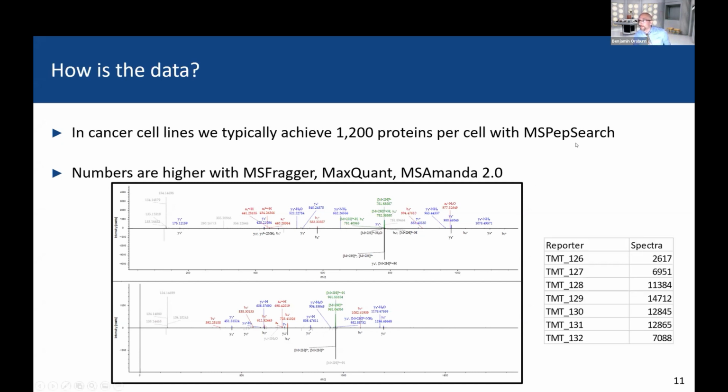And this is actually really new here. Connor Jenkins, when he was working for me in the past, wrote some really smart Python scripts for looking at mass spectrometry data. And it just occurred to me on the phone with him last week that I could use that as a quick QC filter for my data. I could set a signal to noise cutoff for my reporter ions and have it kick back, for each file, how many reporter ions am I seeing in that range? Typically what I'm seeing across here is that we always see something in the 126 in our blanks, 127 and 132 look a little weird, but in general, we're getting lots and lots of spectra with reporter ions.